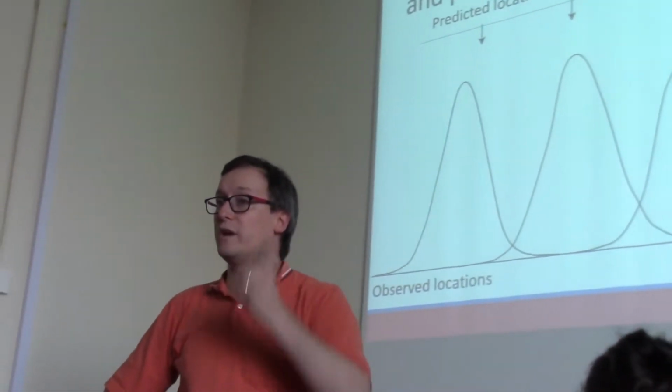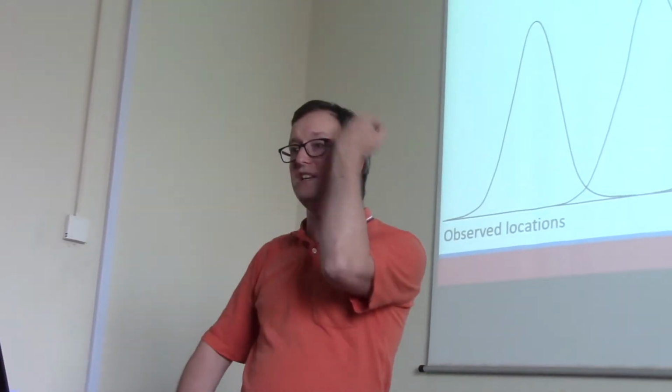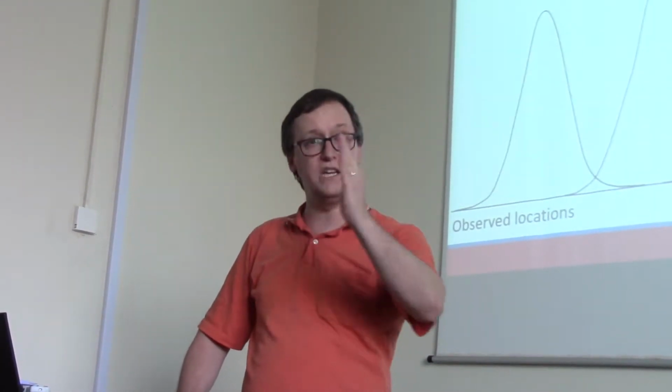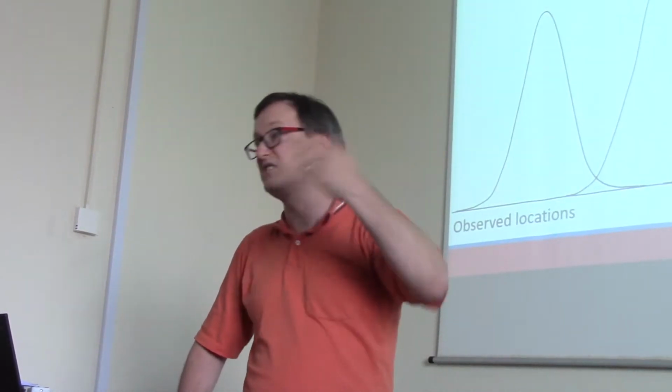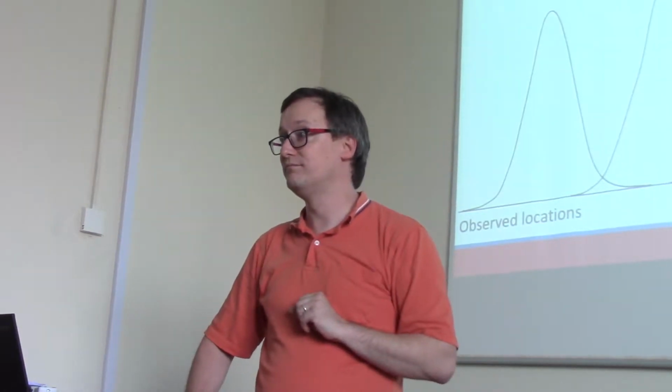Okay, so that is one of the ways that we can use Fourier Transform to infer a frequency out of the electropherogram and ask whether an individual peak matches with that overall pattern of peaks and valleys. Everyone good with that? Okay.